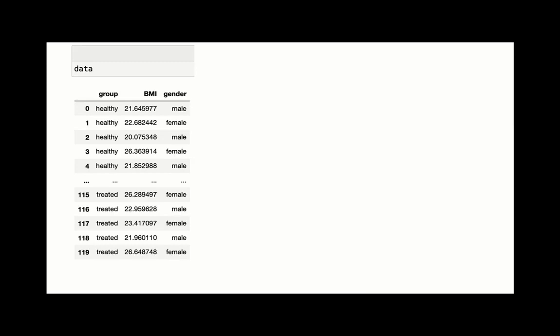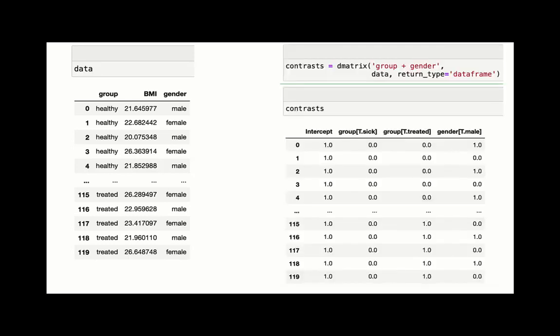It might seem like a lot of work, but now we have computers that can automate much of this process. We can use formulas to specify our experimental design to automatically generate our contrast matrix. As you can see, this contrast matrix was generated in one line of code using a software library called Patsy. These formulas can be highly expressive—you can encode continuous quantities and interaction terms to enable more complex experimental designs. I highly recommend checking out this library for more details.